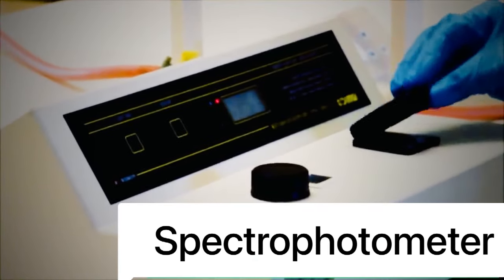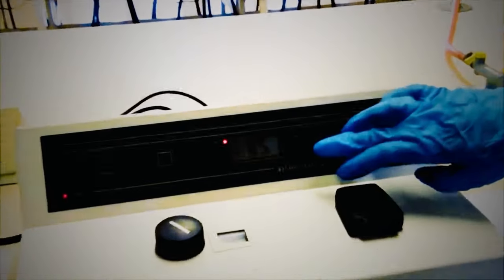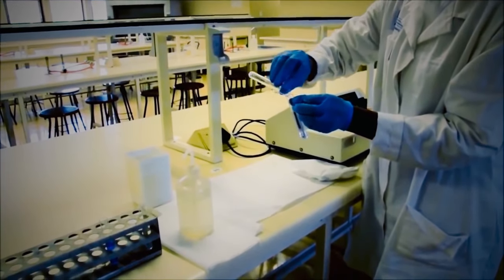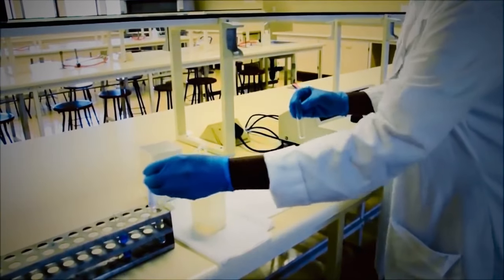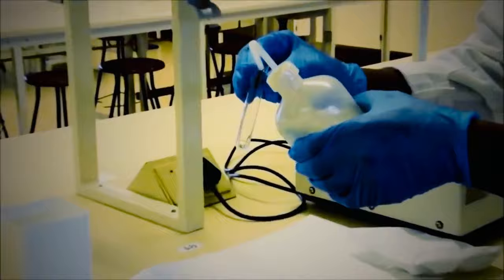Spectrophotometer. A spectrophotometer is a device used to measure the intensity of light as a function of the color of light. In clinical laboratories, spectrophotometers are used for many applications such as quantitative analyses, kinetics, spectrum scanning, and multiple components DNA protein testing.